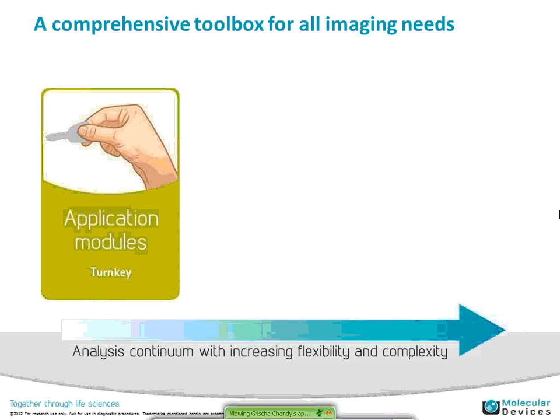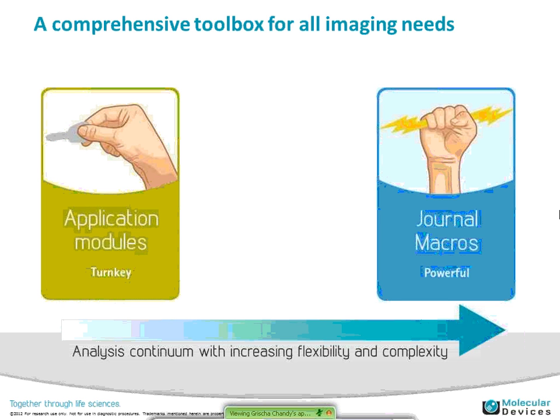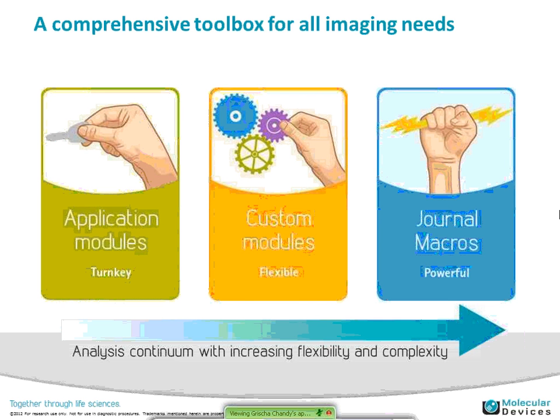The analysis continuum starts with core applications, meaning turnkey application modules. I will explain those to you, and Julian uses that quite extensively. And then at the other extreme is some type of powerful macros to be able to customize the analysis. What we've recently come up with is something in between that bridges the gap between the turnkey and the complete scripting, and that's something we call custom modules. I will go through explaining what a custom module is. But once the custom modules are created, what's nice about it is they now become standard application modules that you don't need to customize. You can make them once and reuse them and share them.